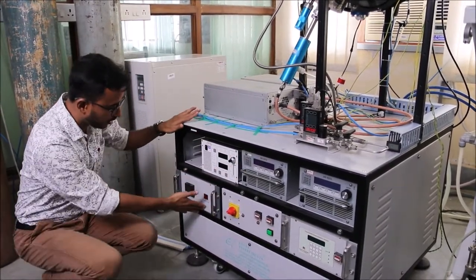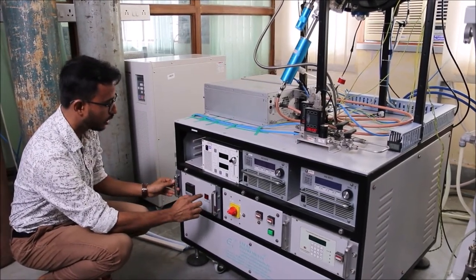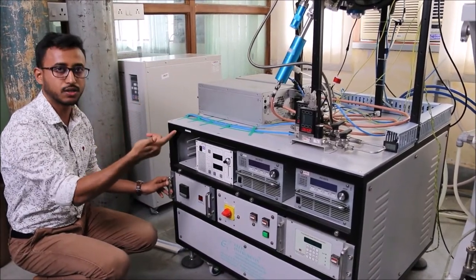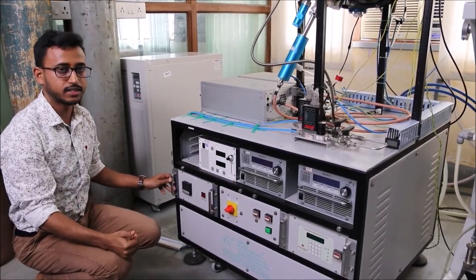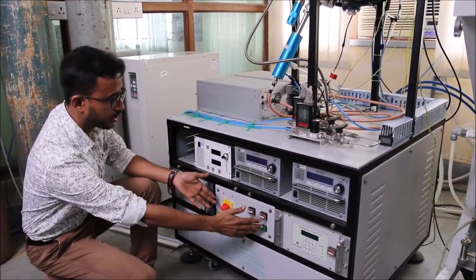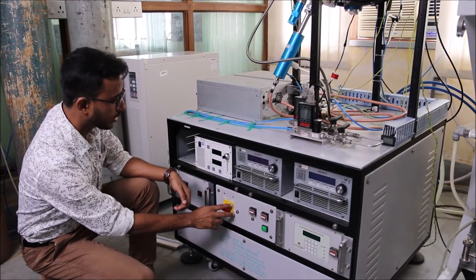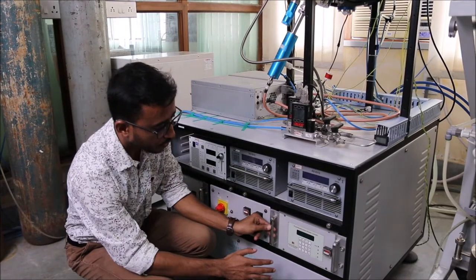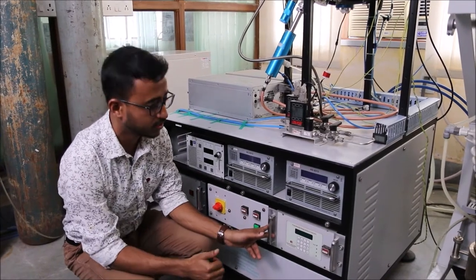At the bottom is a temperature controller unit. Our temperature heater coil is connected very close to the substrate so that during deposition we can heat the substrate and grow our film at a desired temperature. There are also switches for the mass flow controller and to set the output from the DC sources. This is the controller for substrate rotation, which helps us grow a uniform film throughout the substrate.